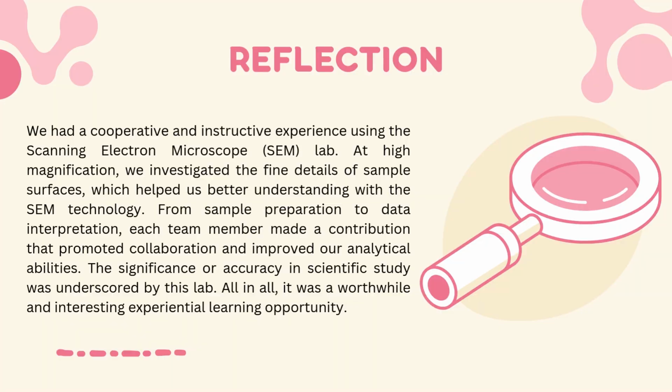Next, for the reflection part, we had a cooperative and instructive experience using the scanning electron microscope lab. At high magnification, we investigated the fine details of sample surfaces, which helped us better understand the SEM technology. From sample preparation to data interpretation, each team member made a contribution that promoted collaboration and improved our analytical abilities. The significance of accuracy in scientific study was underscored by this lab. All in all, it was a worthwhile and interesting experiential learning opportunity.